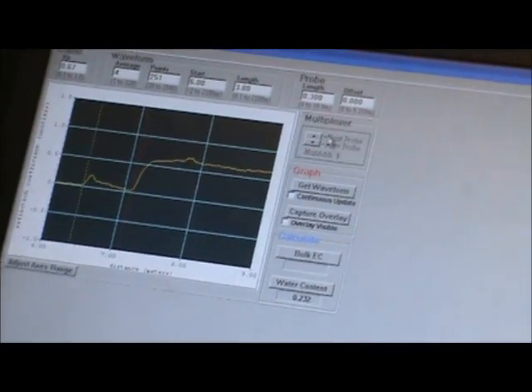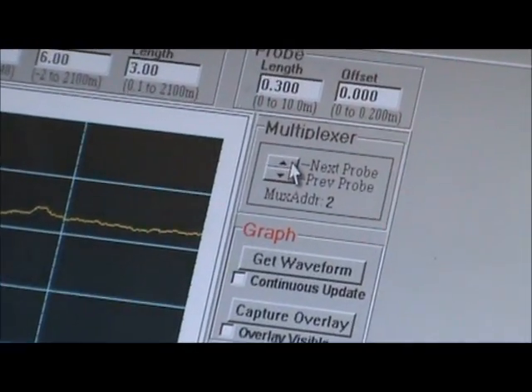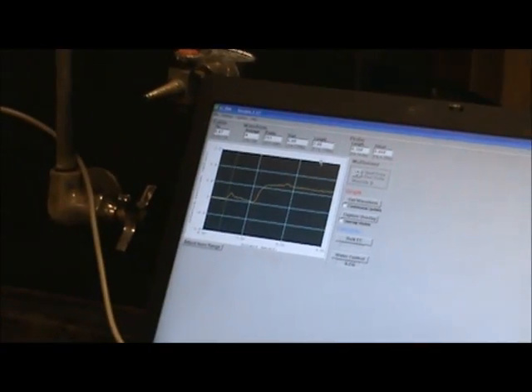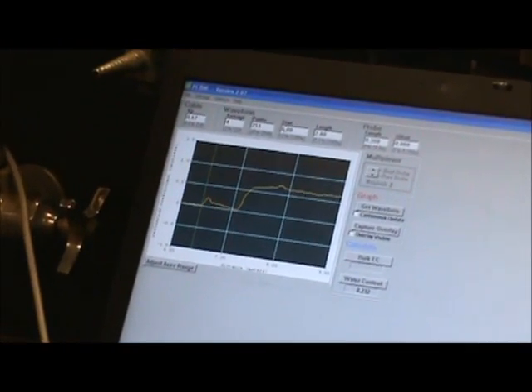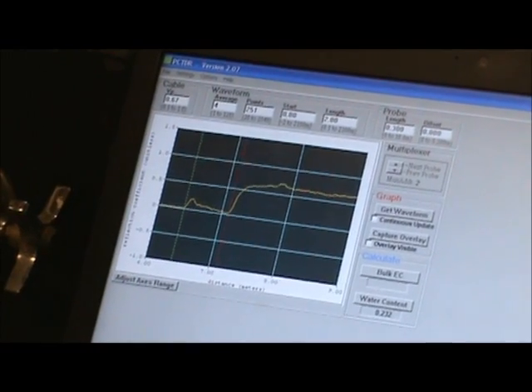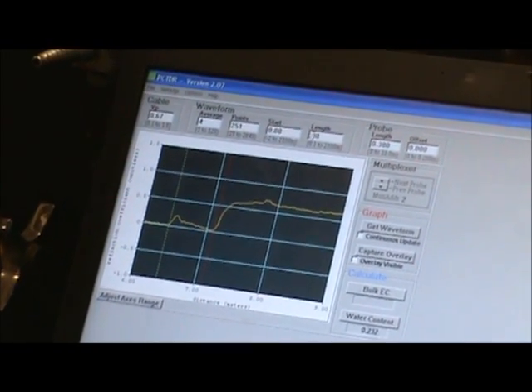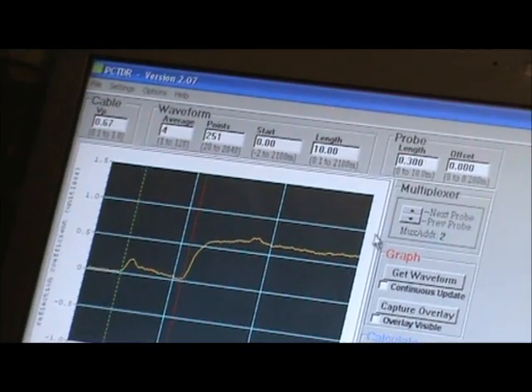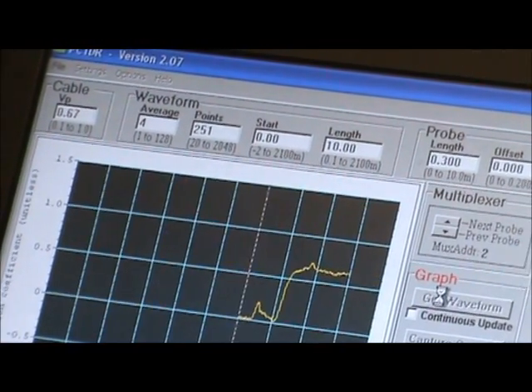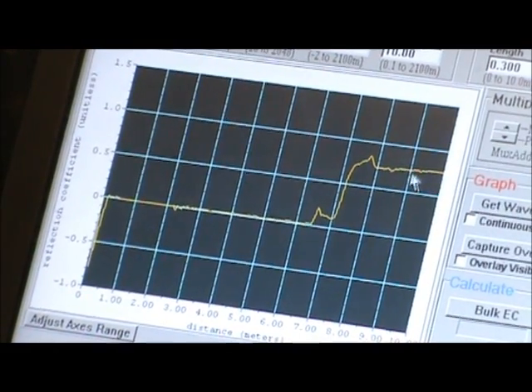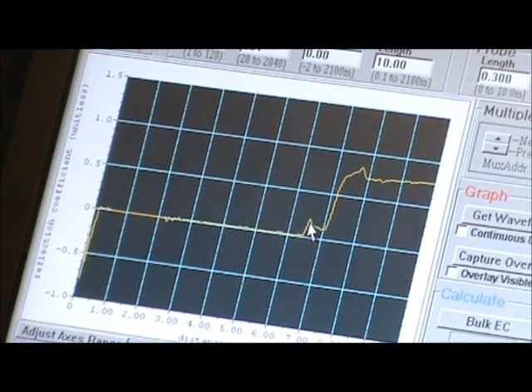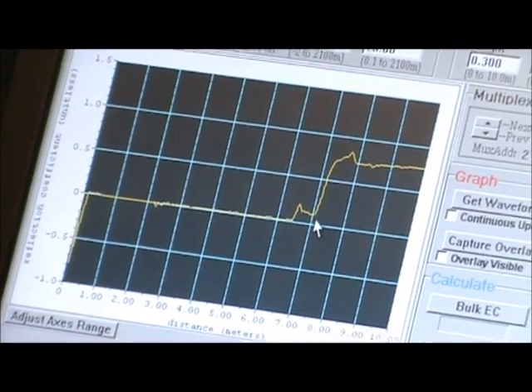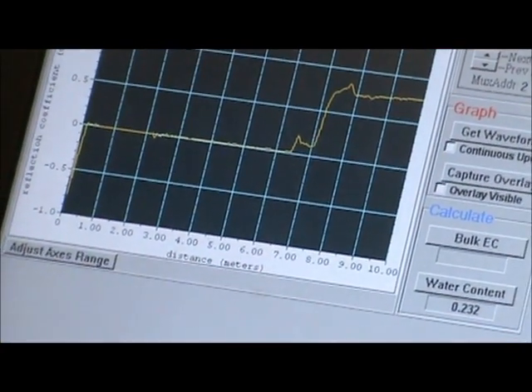And then we want to get our reading from probe 2, which is shallower in the sand. And to find our disturbance, we want to start again at the beginning, and get our waveform. And as you can see, here's where we're looking. So this is where it hits the sand, and this is the end of the rod.